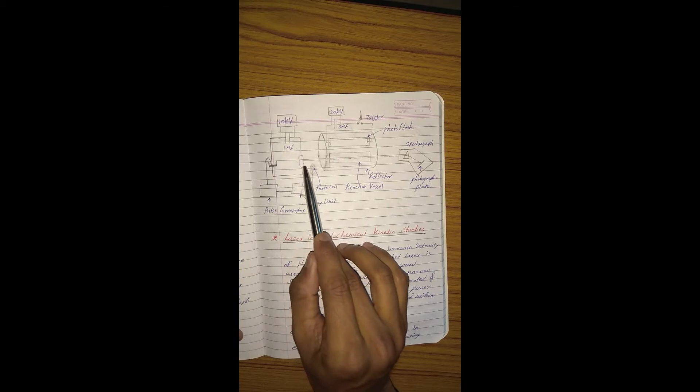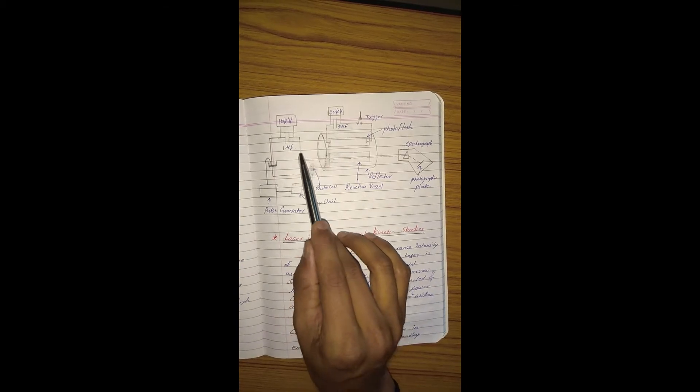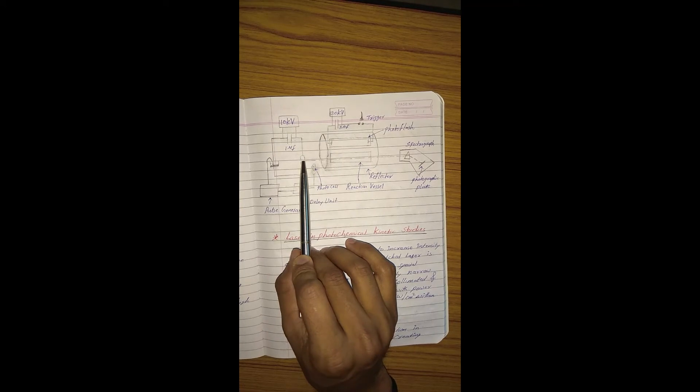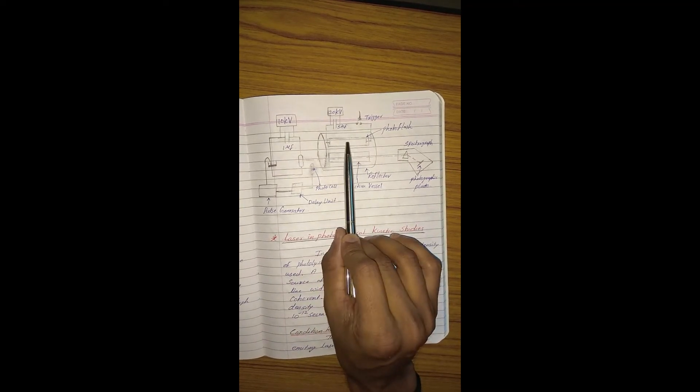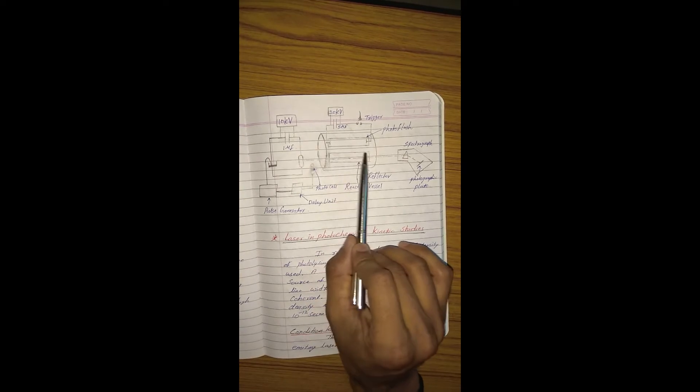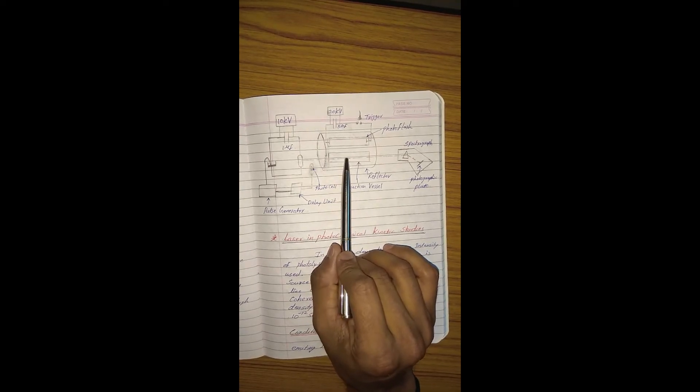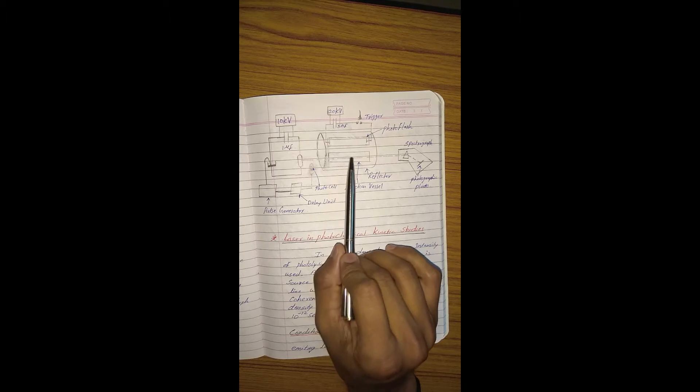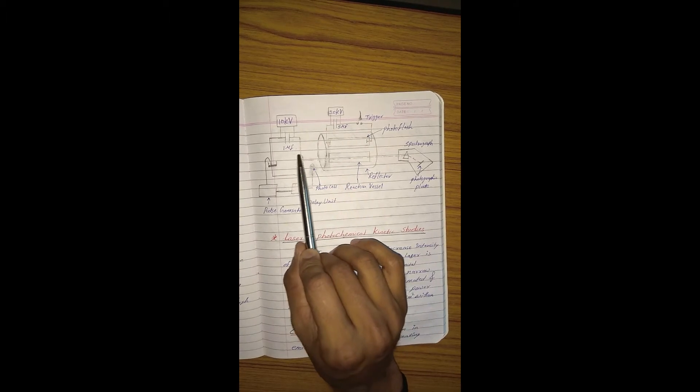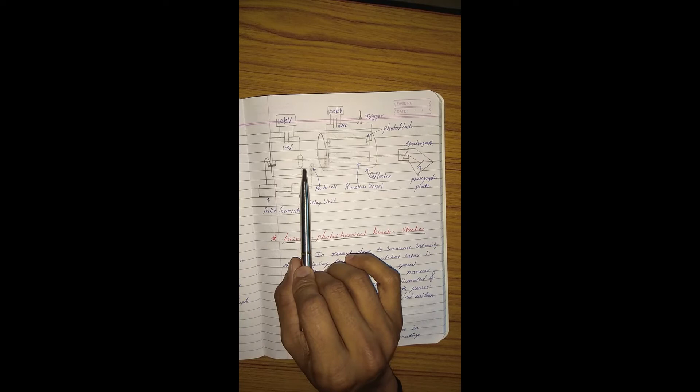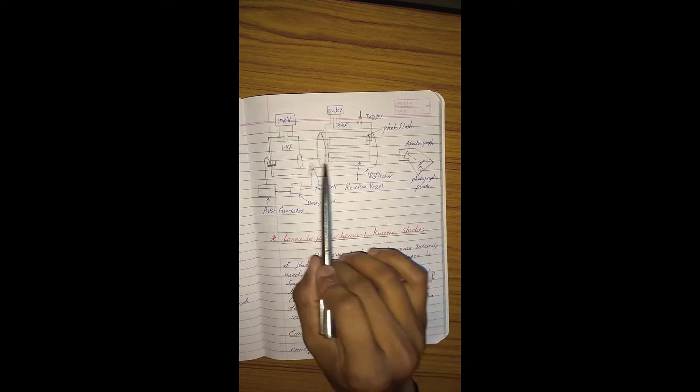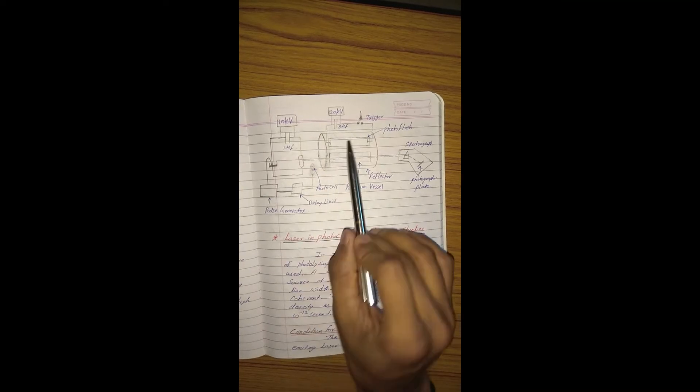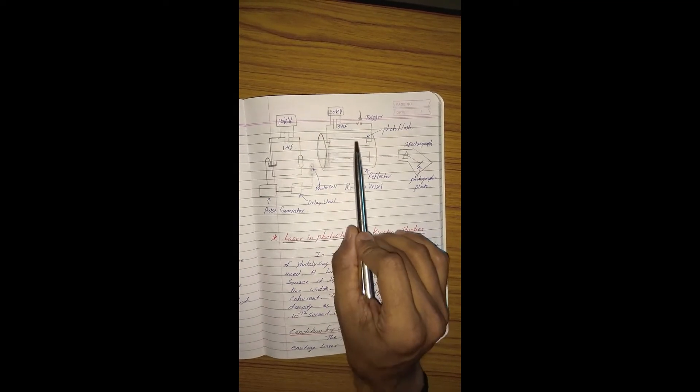This single beam absorption spectroscopy uses a secondary light. This is the primary flash light—using this primary flash light the reaction is carried out in this reaction vessel, and the concentration of intermediates generated is measured by using this secondary light. The monitoring flash is generally applied perpendicular to the photo flash.